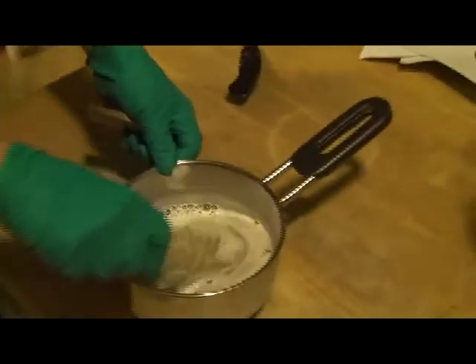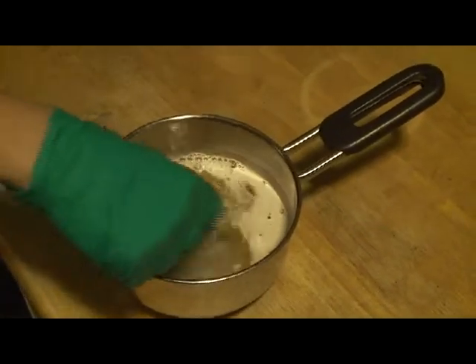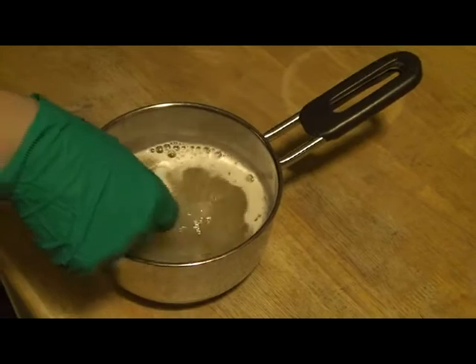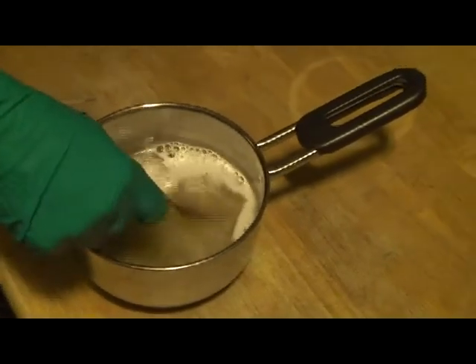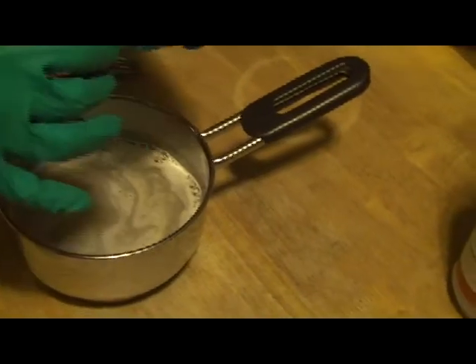Here we are making our gelatin DME solution for our slants, which we use to cultivate the different yeast strands on. It's basically 500 milliliters of water, 50 grams of light DME, and two packages of unflavored gelatin.